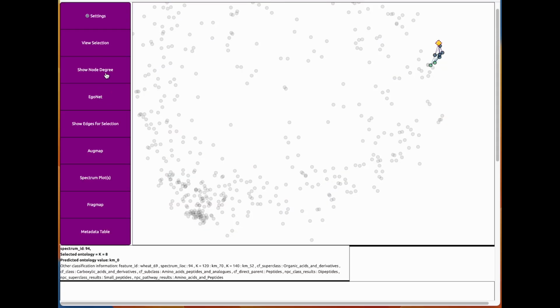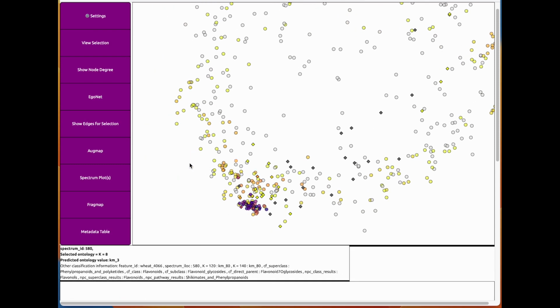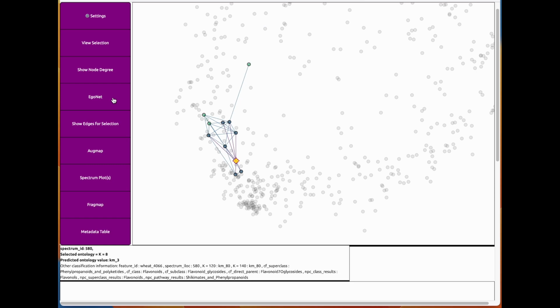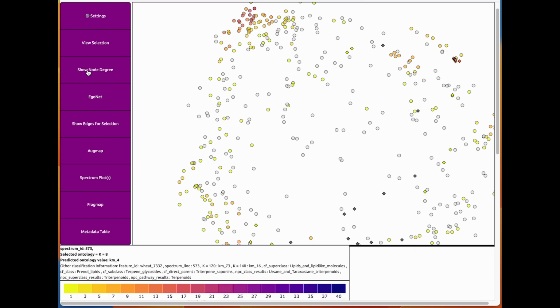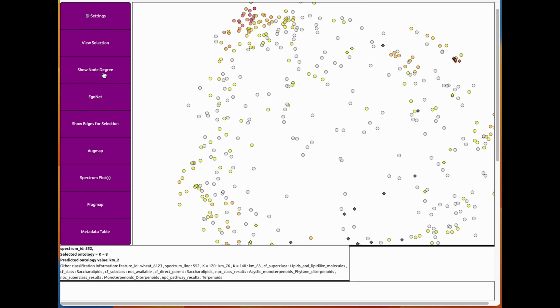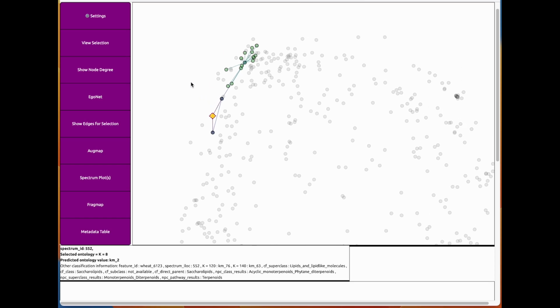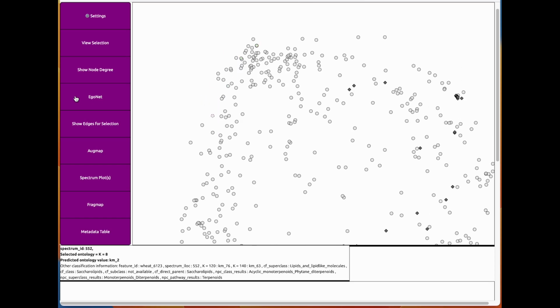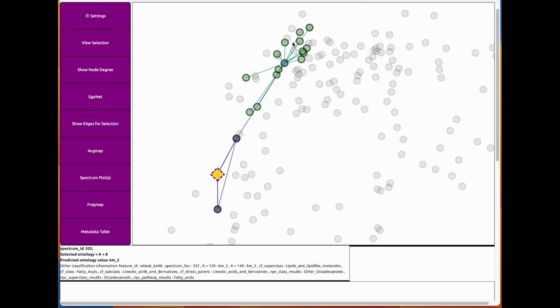An alternative network view in the form of EgoNetworks is also provided. This network view is suitable for assessing the environment surrounding single nodes. In the EgoNetwork, all edges connecting to a single node are highlighted. In addition, all edges connecting to those nodes, and so on, may also be highlighted, depending on the selected hop distance. This view allows connecting sparsely connected nodes to denser clusters.